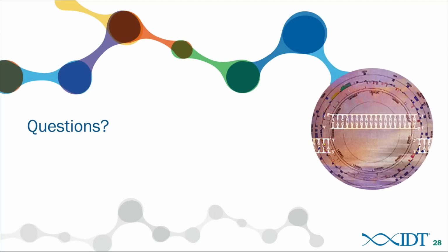Mm-hmm. Yeah, that question came up because there was a publication from the Keith Joung lab that suggests going down to even a 17 nucleotide guide RNA actually can maintain potency on target and dramatically reduce off target because you trim the bases that are most 5', PAM distal sites.